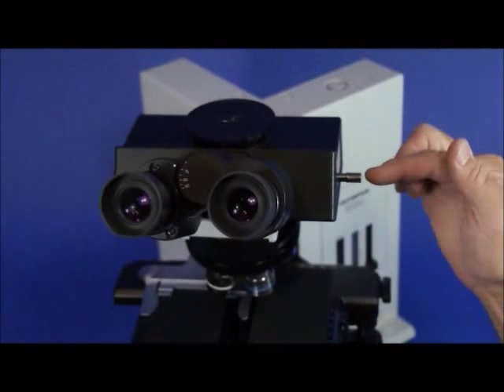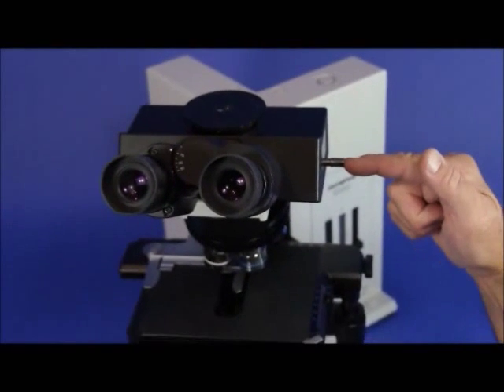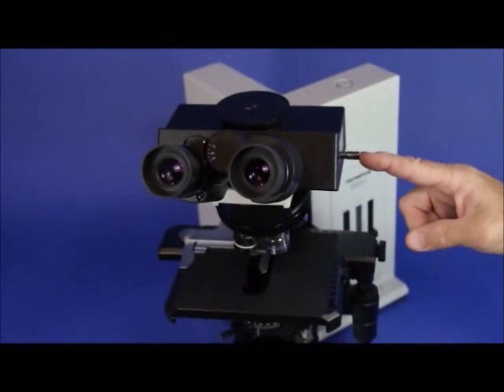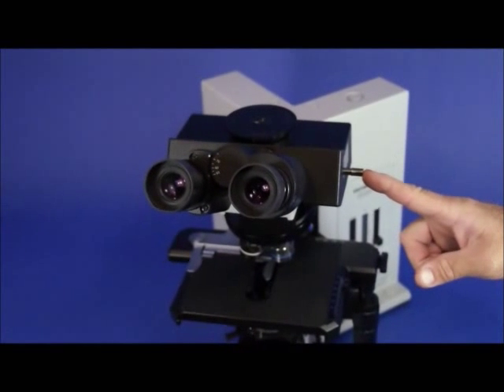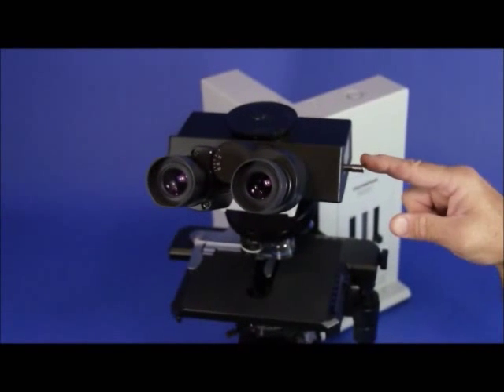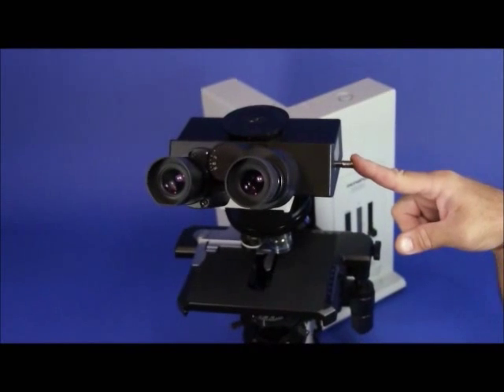And we also have a light path selector on the right-hand side, which is a three-position light path selector. Most ordinary trinoculars are either fixed with one position or two positions. This one has a three-position light path selector.